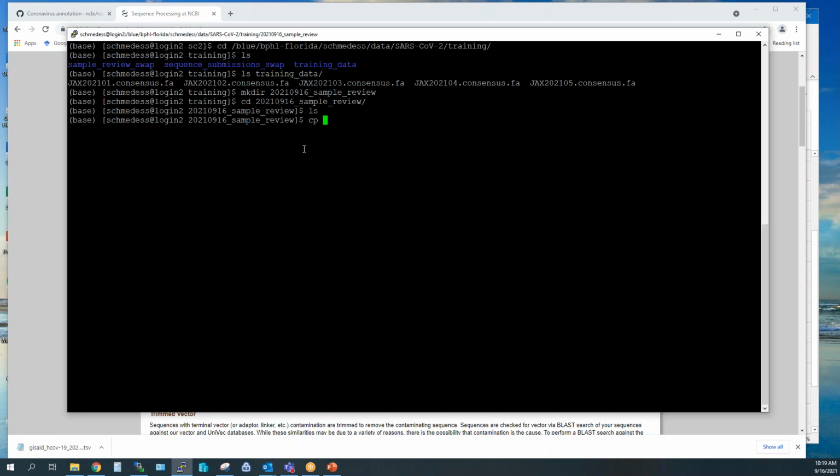We don't use the Dragen Lineage app here. I have some old data from it from a while ago to play around with. I've talked to some of you in some states that use it, to test out these scripts to make sure that it's compatible and works, and it does. The next script in the next part of the process will make a FASTA file that will take in the concatenated FASTA file that I've talked to some of you about, as well as separate FASTA files. If you require or would like this script to work with a concatenated FASTA file, just let me know and we can provide that feature.